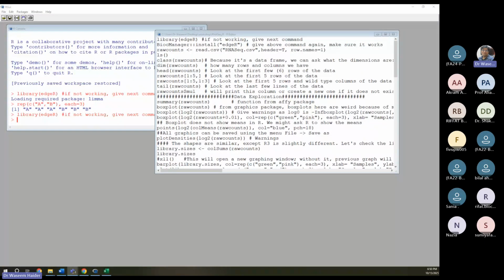When we go to Python, you need to first import another library called pandas, and then the function is pandas dot read underscore CSV, right? My apologies. But R is really good at reading these files. The function is directly there, you don't need to import any extra library. It's like read.csv, and then you can just put the file name here.